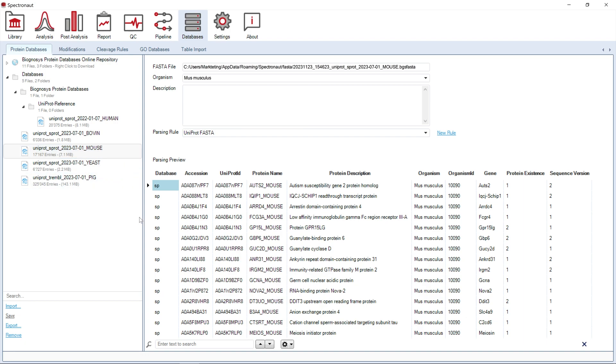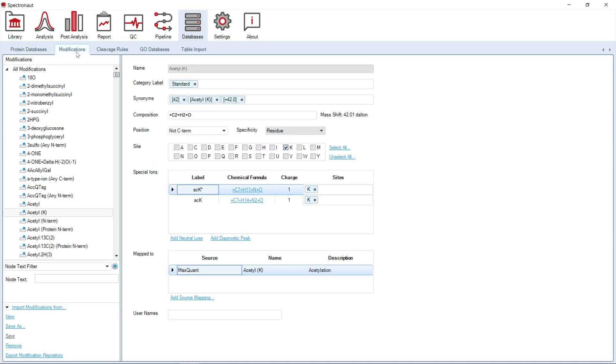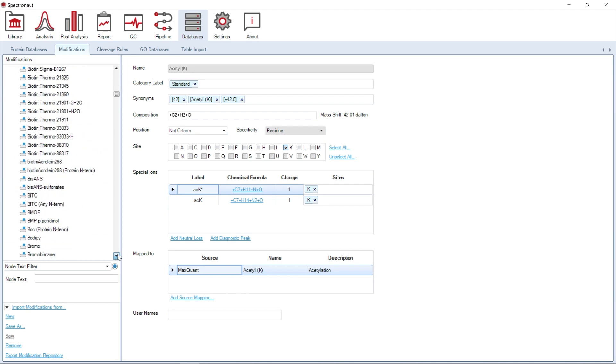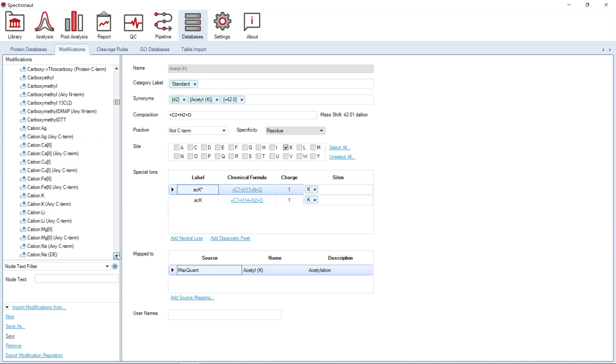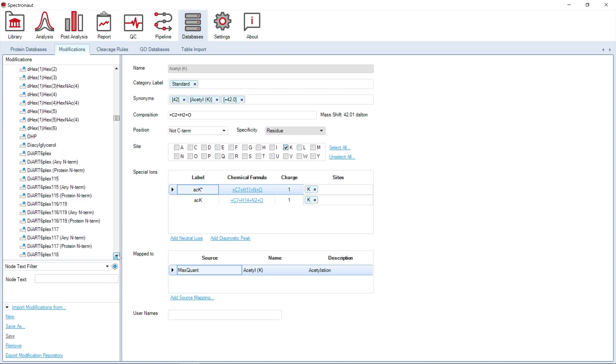The next step in the database perspective is Modifications. This page includes a comprehensive list of modifications like labels, tags, and a high variety of naturally occurring PTMs.